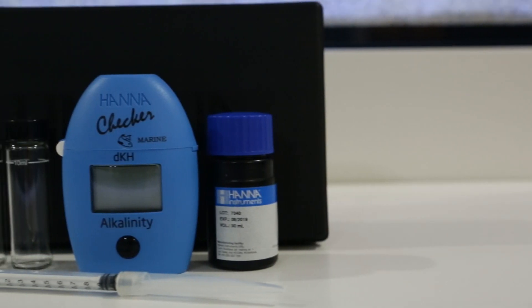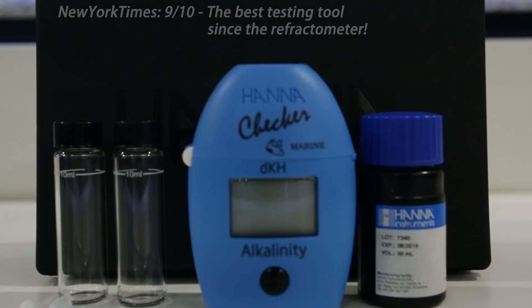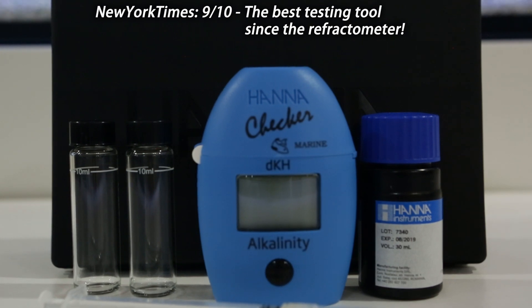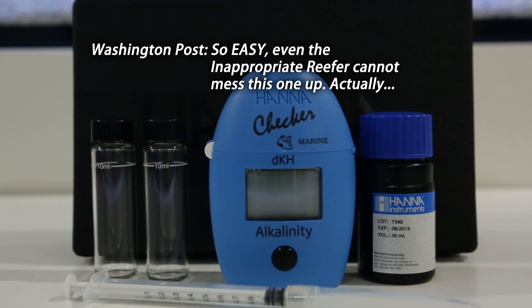Amazing. The HANA Checker is so good, you'll be hating yourself for not having gotten one sooner. The New York Times says it's the best testing tool since the refractometer. And the Washington Post says it's so easy, even the inappropriate reefer can't mess it up.